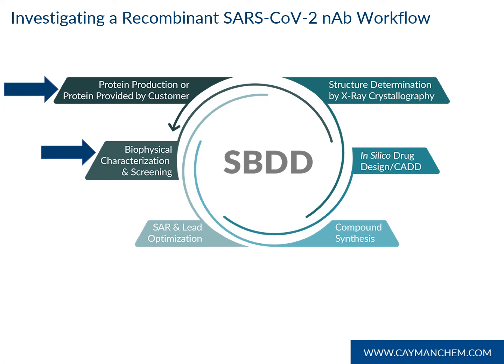We could establish a SPR platform to evaluate binding kinetics and affinity measurements for ACE2 and recombinant neutralizing antibody towards SARS-CoV-2 S1 RBD. Lastly, we could successfully determine cryo-EM structure of the SARS-CoV-2 spike glycoprotein in complex with the neutralizing recombinant antibody Fab region in a collaboration with Thermo Fisher Scientific.